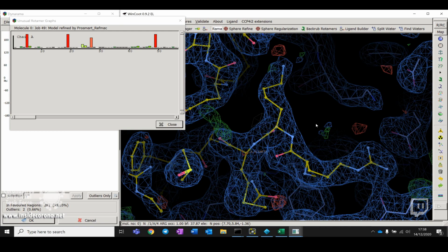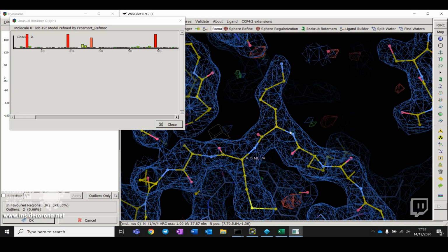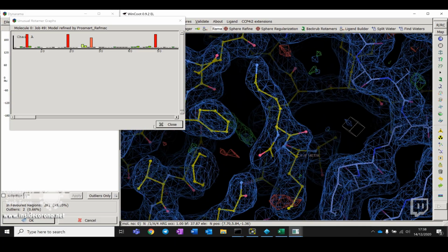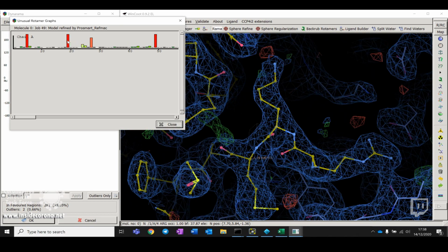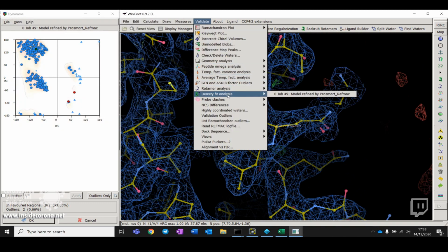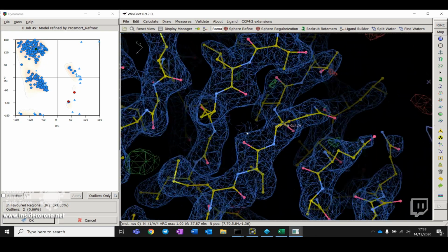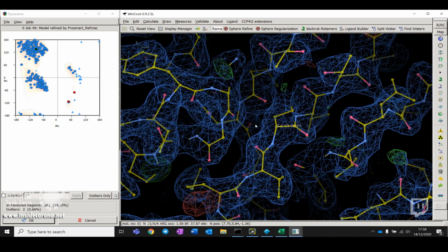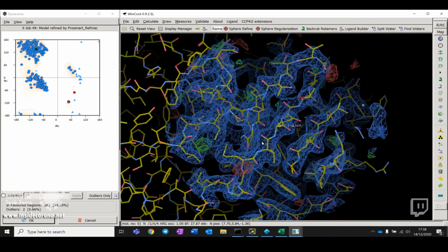So we kind of just have to accept this and move on, because it's much more important that this backbone makes sense than that this really, really flexible residue is defined. Yeah, that is probably the bulk of what we're doing when we're going through the structures. We can also check all of the water structure, but there aren't really many waters in here because I haven't added any yet. So that is, for the most part, what we are looking at in our structures.